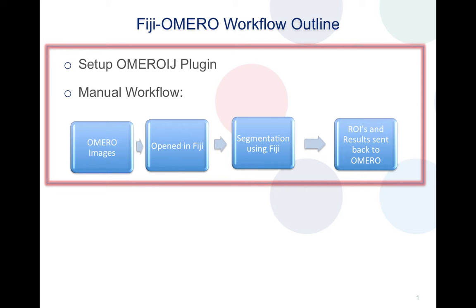Fiji is nothing but ImageJ and is an open source image processing software. The first step that we'll cover is the setup of the OMERO ImageJ plugin under the Fiji folders, and the second part would involve using the OMERO ImageJ plugin to open OMERO images within Fiji to do some kind of analysis — in this case segmentation — and then eventually sending the results back to OMERO.